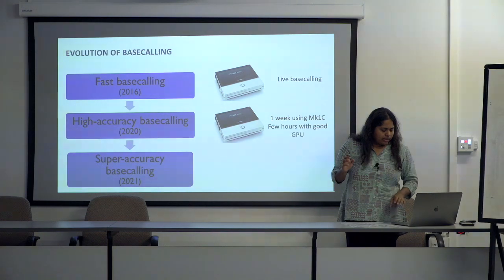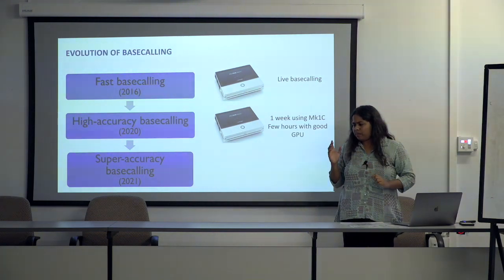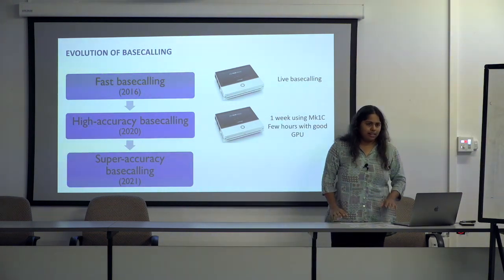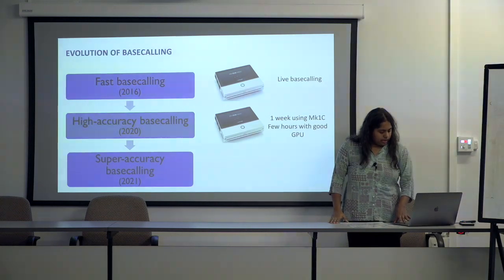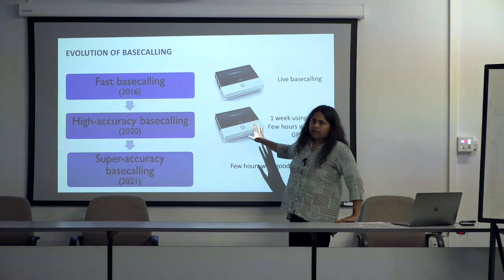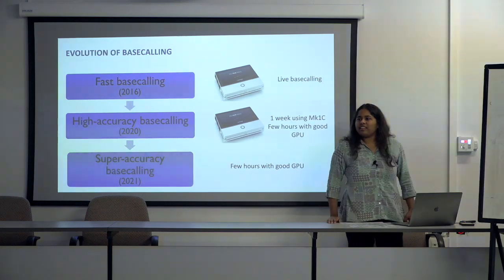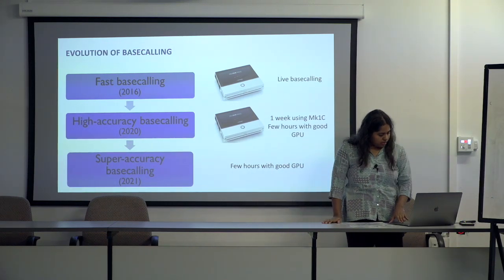And there are recommendations. I think Benton has really explained this well, which GPU you want to buy, and I think that's available publicly if we ever want to see that. With super accuracy, this device just couldn't handle it, so you have to rely on something external, which is what Natasha thankfully provided, and so we could do these base calls yesterday.